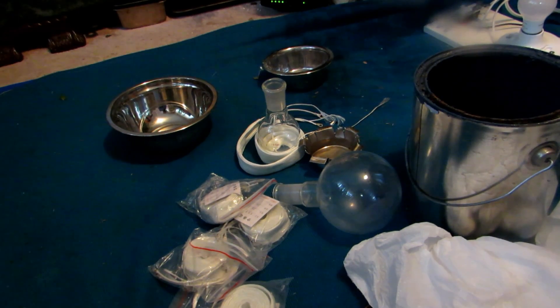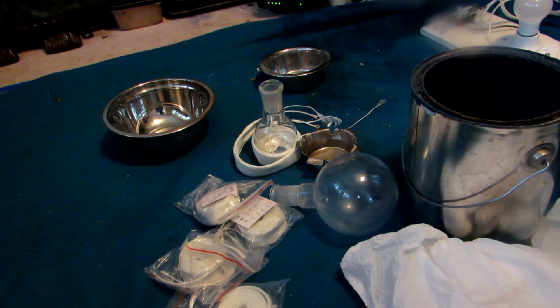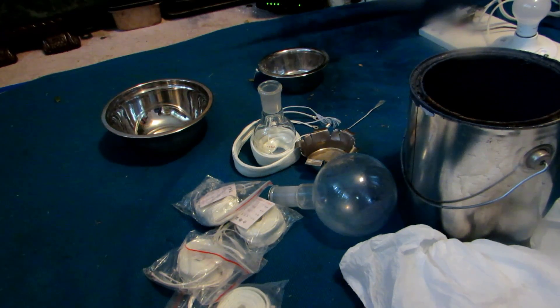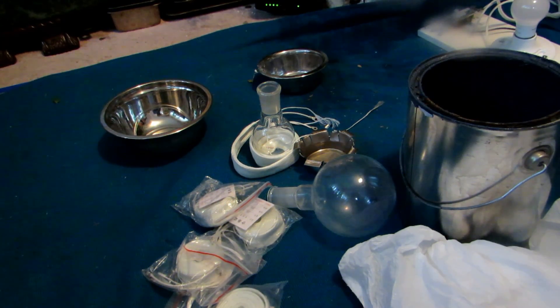Hey guys, welcome back to another video. Today we're going to be doing something I've wanted to do for quite a long time - make a heating mantle. Online, heating mantles can be several hundred dollars and very expensive, especially for good quality ones which will reach high temperatures. So today we're going to be trying to make one for just a couple bucks.